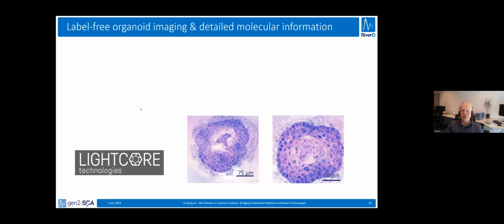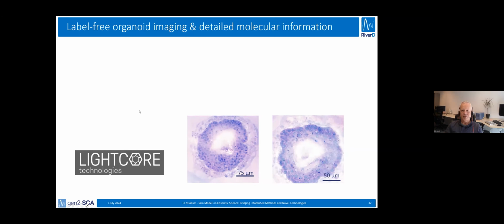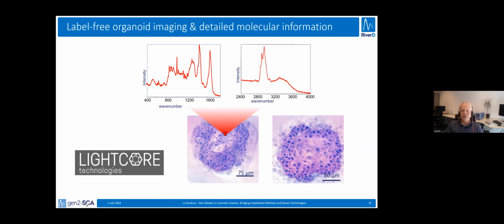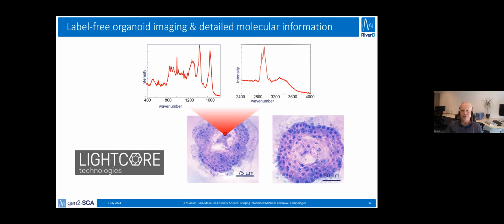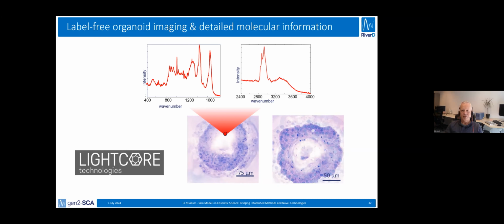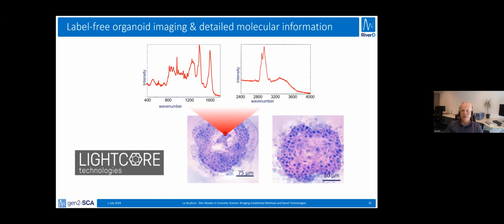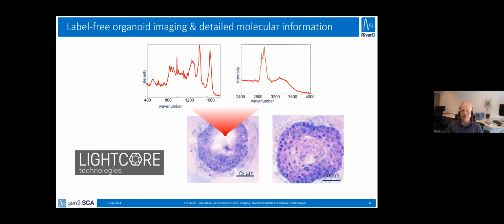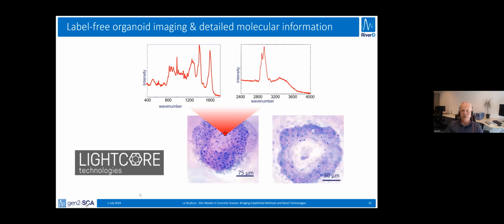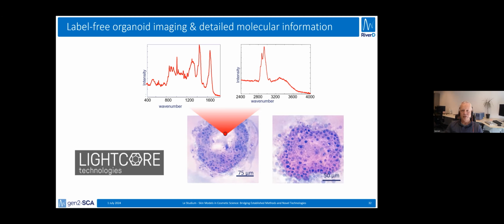Now what you can do, this of course gives you a lot of structural information, and just as in the previous talk suggested for LC-OCT, you can combine this with spontaneous Raman spectroscopy to get the full spectroscopic information at any location that you want for further interpretation. And this is something that we're starting to explore together with Lightcore Technologies in Marseille.